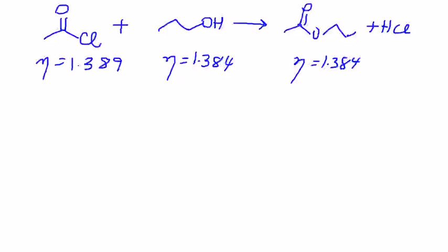Okay, the next lab for you guys is an esterification reaction, which is what we'll learn more about in chapter 21. But right now we have gone over alcohols, and we do know that alcohols have a tendency to react with, for instance, I showed you in class sulfonyl chloride. In this case we have an acid chloride, specifically acetyl chloride.